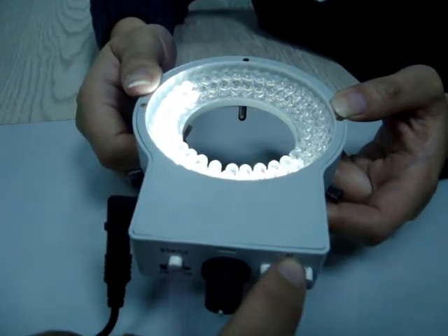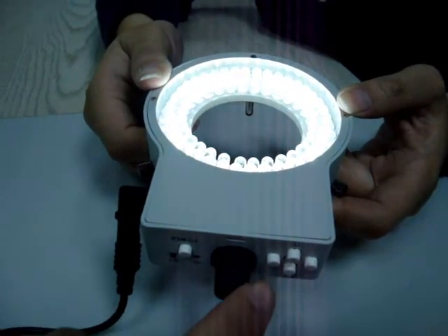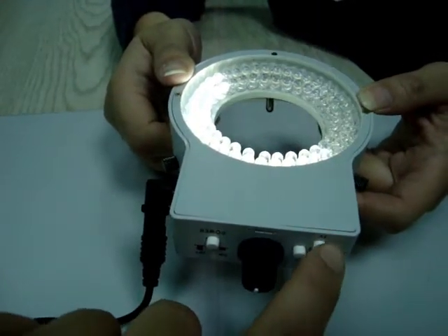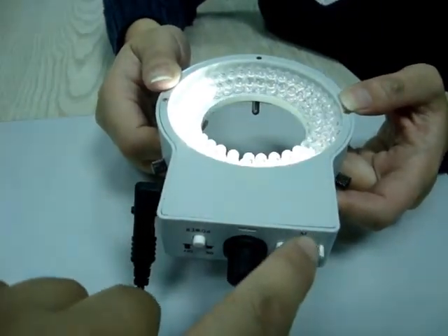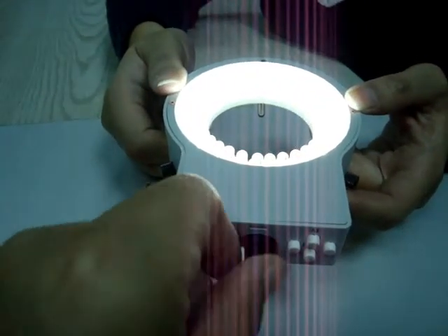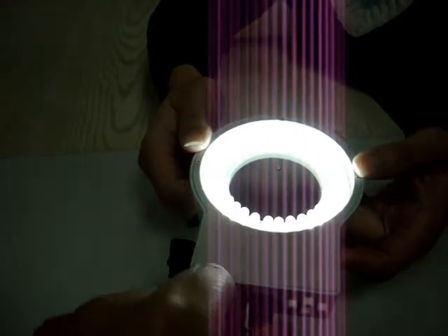You can also try another area — this one. Four individual areas which can be controlled very easily. This is the brightest, and you can also make it lower.